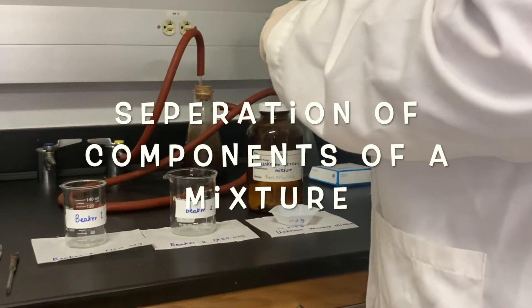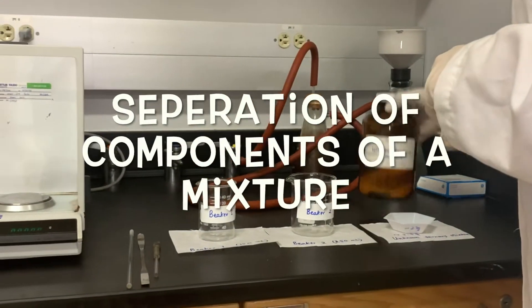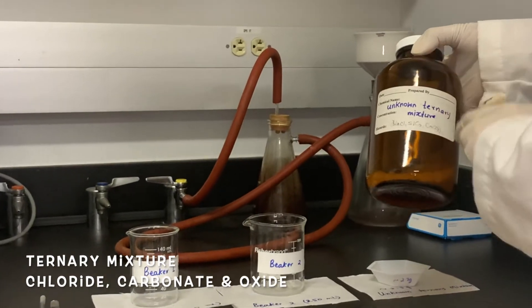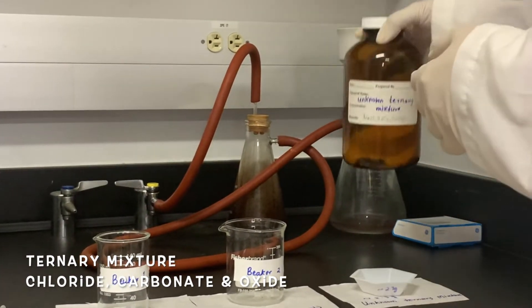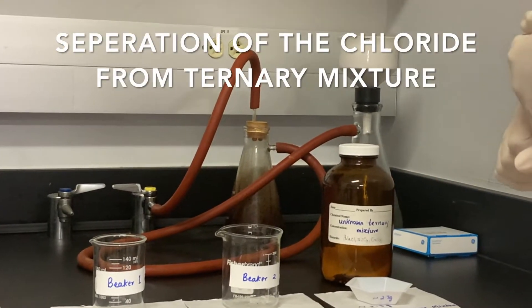The topic of today's experiment is the separation of components of a mixture. We have this unknown ternary mixture — a mixture of three components: the chloride, carbonate, and oxide. We are going to separate all three components from this unknown mixture.